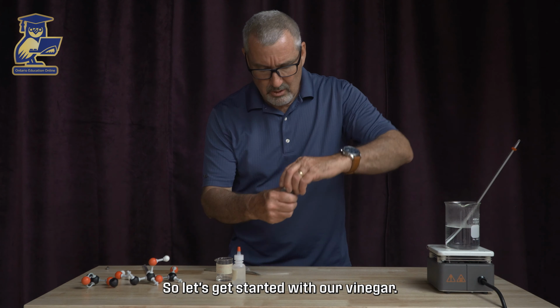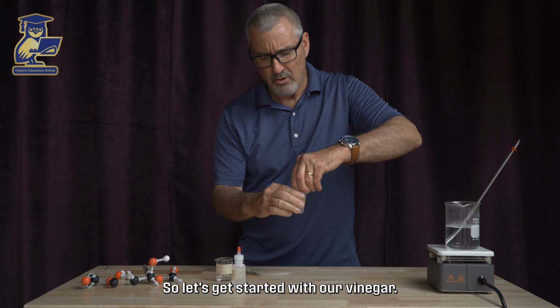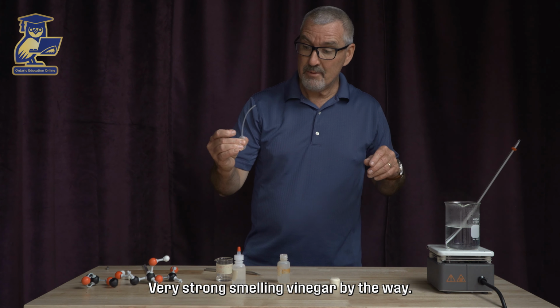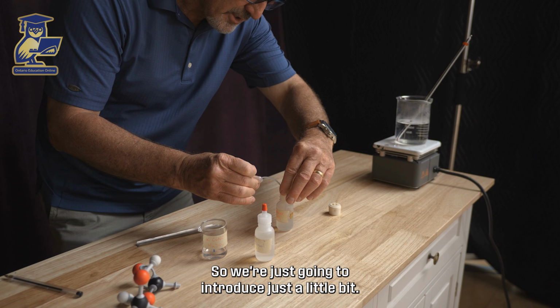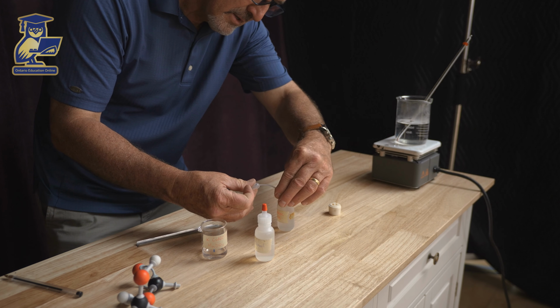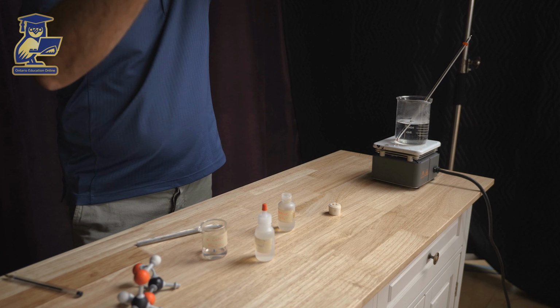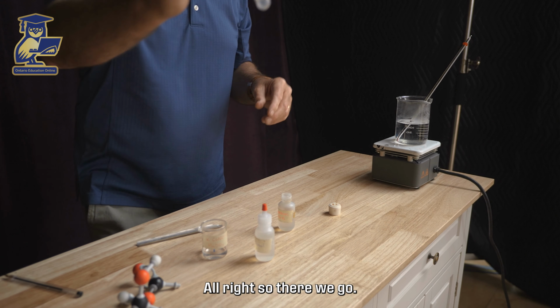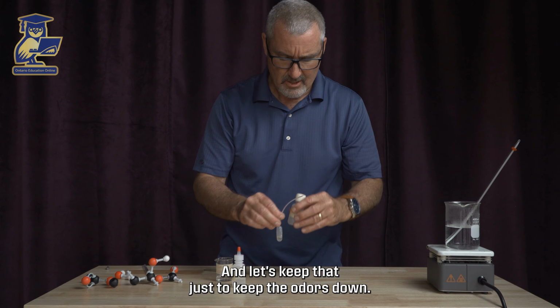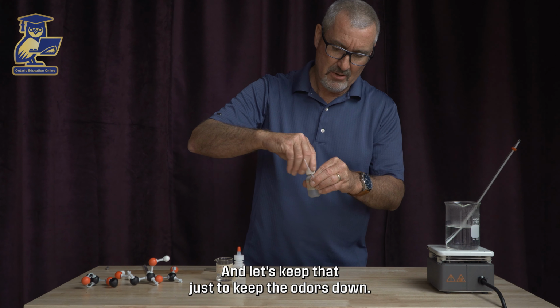Okay, so let's get started with our vinegar. Very strong smelling vinegar, by the way. So we're just going to introduce a little bit. There we go. We've got our vinegar right there. Let's cap that just to keep the odors down.